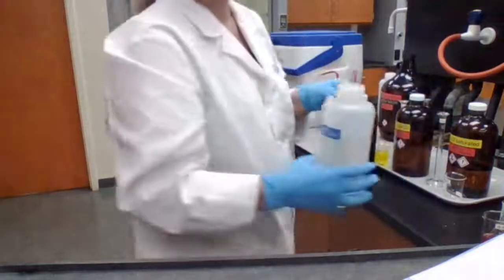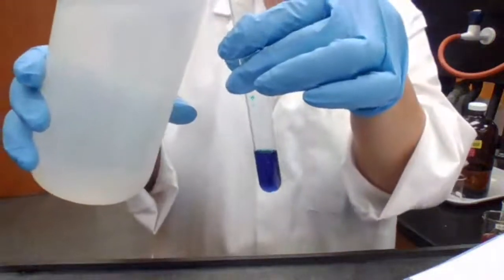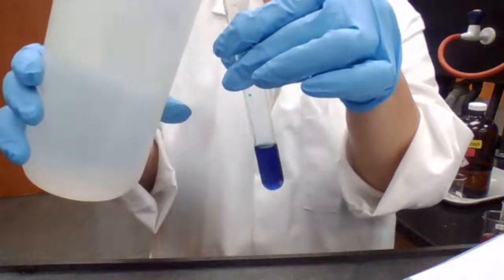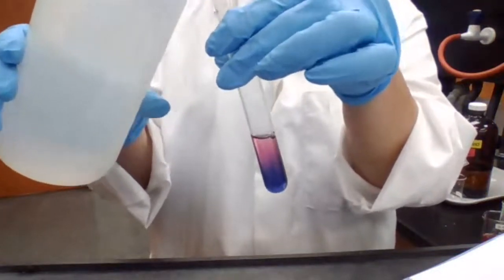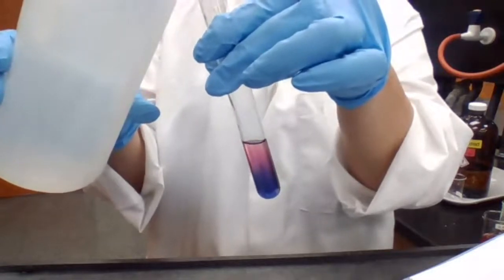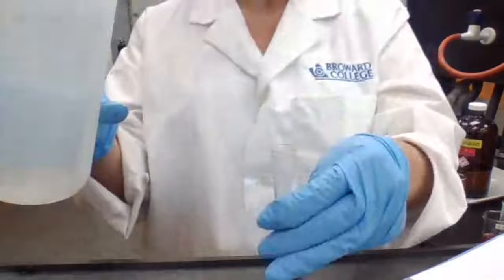If you go back and check the reaction mixture, adding water is not just going to go from dark color to light color because of dilution.